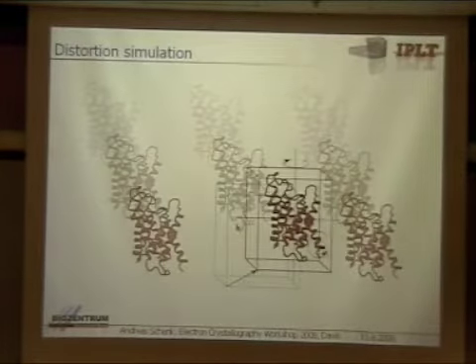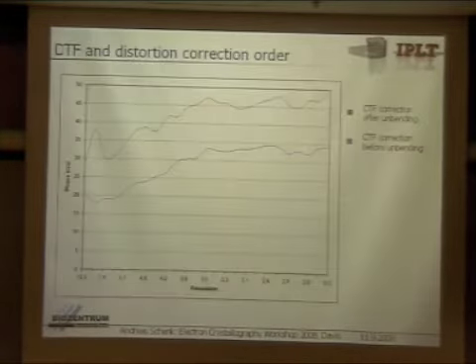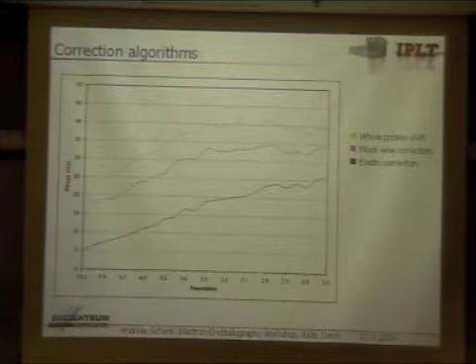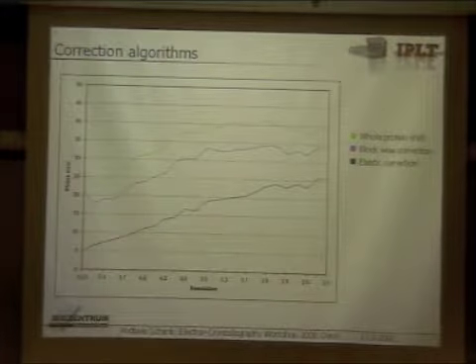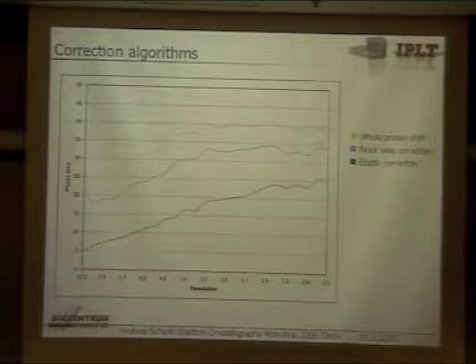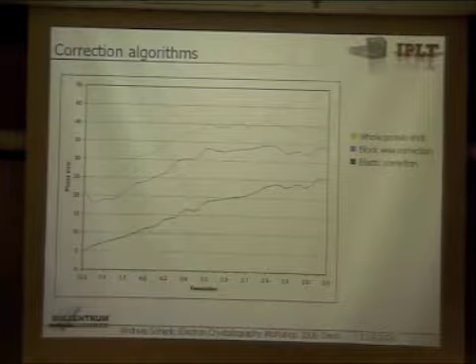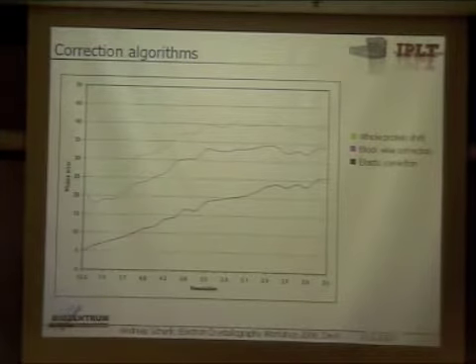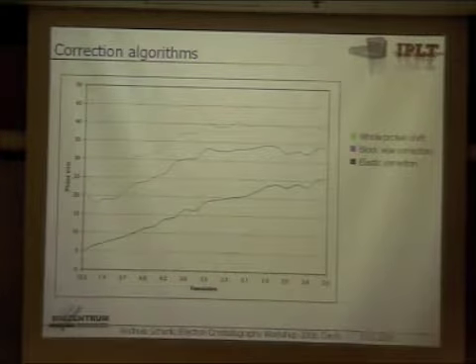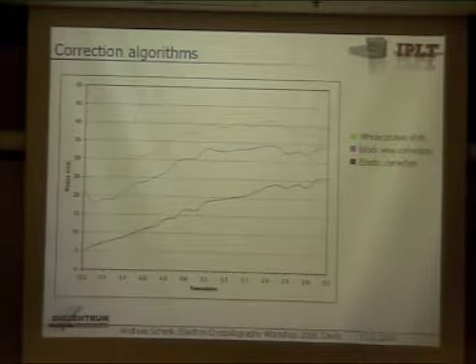No, that's too simple, because the plots show that there's a change in the phase. We know the perfect solution in the unit cell, and the envelope is just an amplitude correction, but we're talking here about a phase error. So there's something much more complicated going on than just multiplication with a real number. The high resolution components are shifted away from the center of the point image, and if you shift those, that's a phase shift of those higher frequency components. Or you lose them, and that's an envelope.